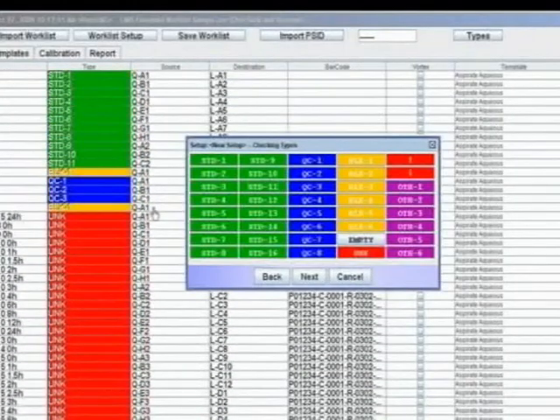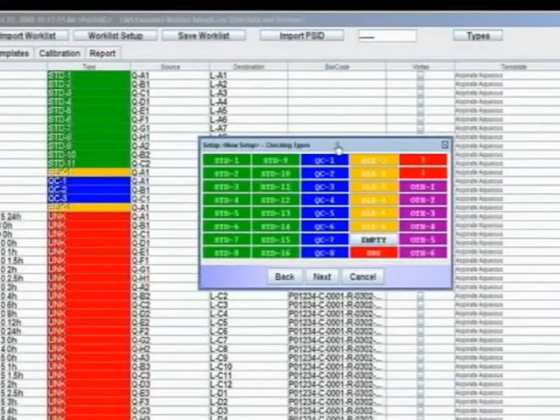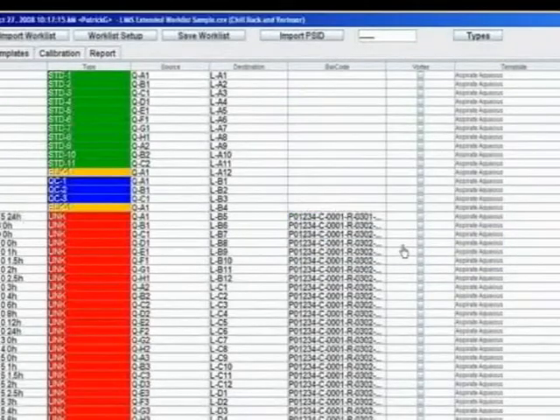The other category may be used to designate different types not listed elsewhere. Other is used in the same manner as all of the other type designations. It simply provides a catch-all type category. After assigning the correct type to all samples, click Next to proceed to the next step.